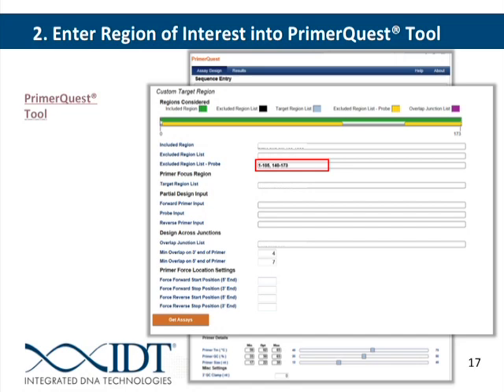So now we can go back and adjust some of those parameters if we want some additional assays to work with. We can start by looking at this one and seeing if this one will suit our needs. And so from here you can click View Assay Details, and it shows us forward primer, probe, reverse primer, and where they're located on that sequence of interest. So going back here, this is our first region we're designing to.